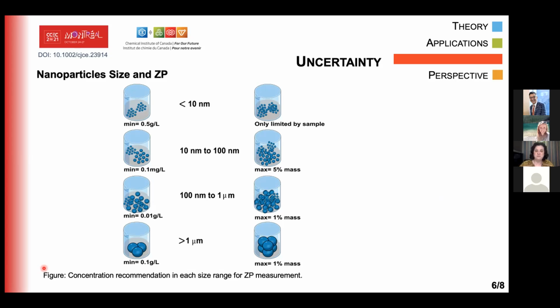So one of the good tips to work with zeta analysis is to try to know the size of your sample.